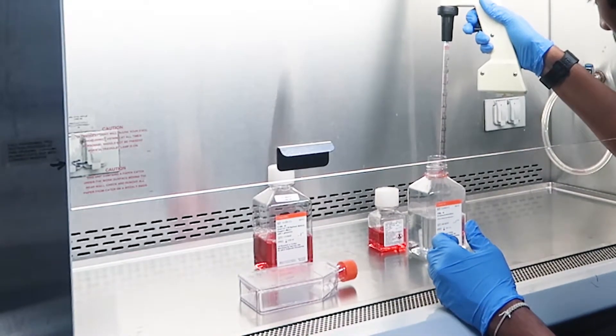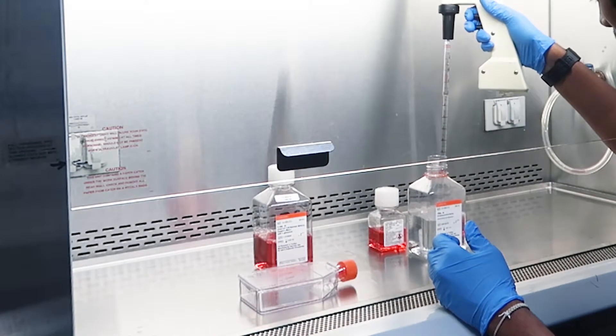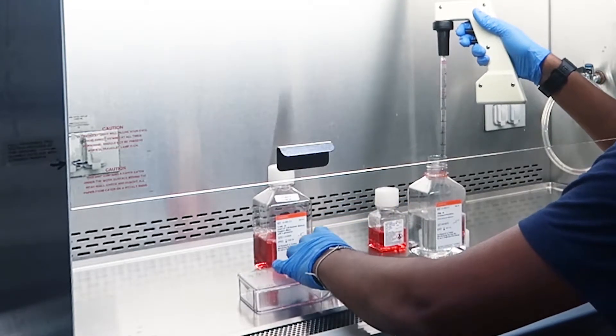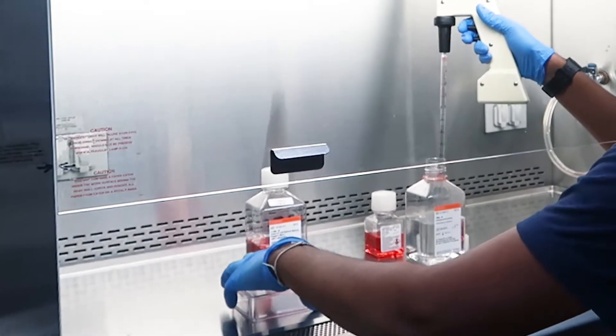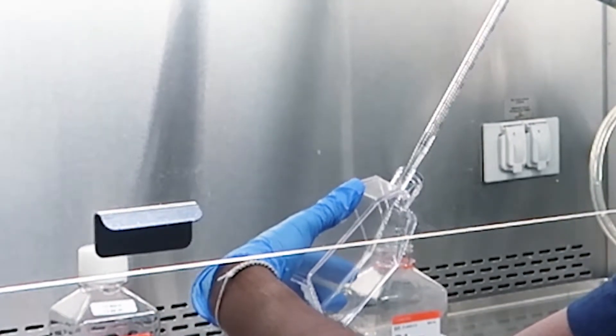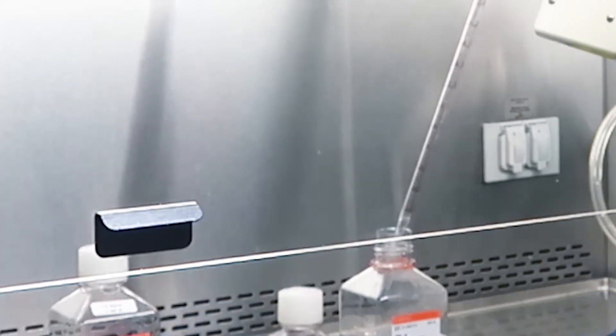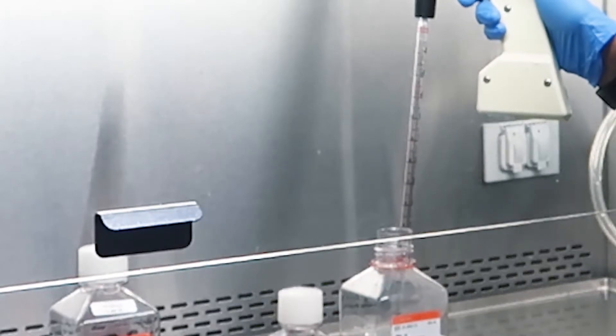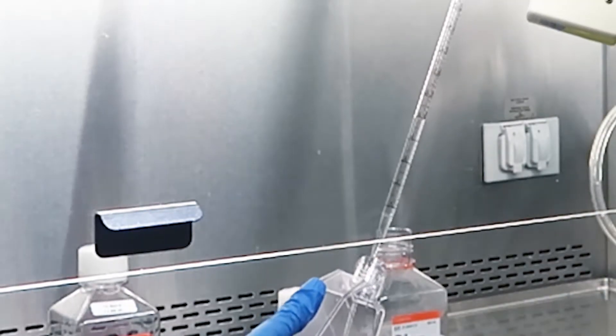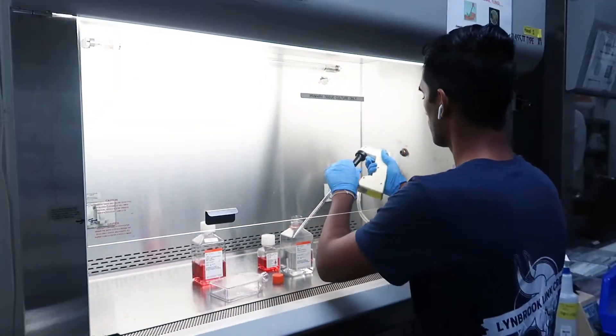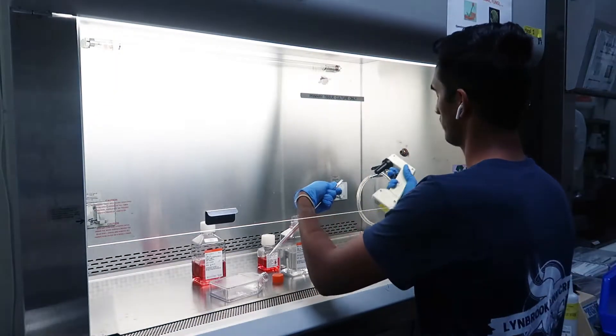Now I've already gone over the serological pipette pump, but just as a reminder, the top button is to pull up your medium, and the bottom button is to release your medium as we're doing here. Now make sure, when you release this PBS, that you do not directly release it onto the cells to avoid dislodging the cells. And so make sure you hold the flask skewed so that the PBS is released onto the sidewall.